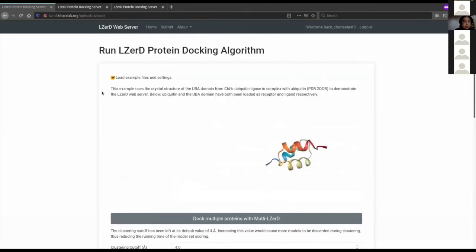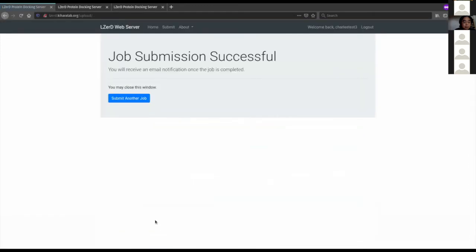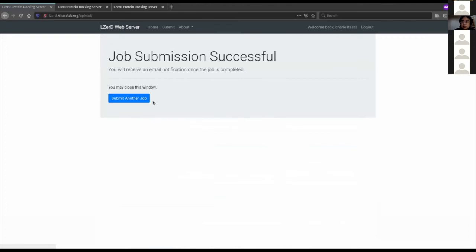I'm going to reload the page and then click submit. This was successful. The LIZARD web server has a cache of pre-docked models, so if you submit models that someone has already docked before, your job will basically finish immediately. I just received a 'your request to LIZARD is processed' email immediately.